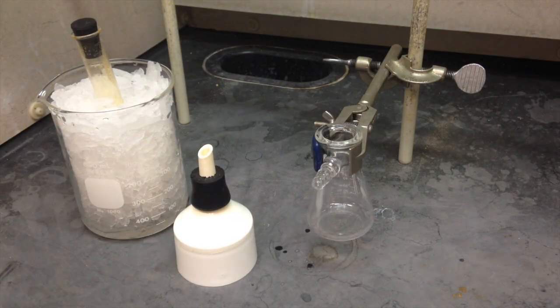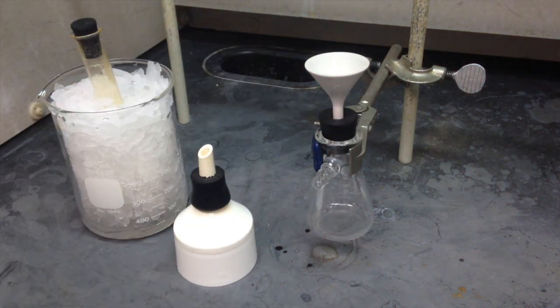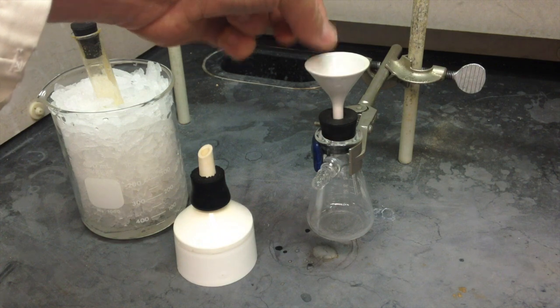That's a Buchner funnel. We don't want that. Put that aside. This is a Hirsch funnel. We want the Hirsch funnel. That's the little guy. That's the one we're going to use. And the matching little filter paper. It's this little tiny guy. Just stick it in there.